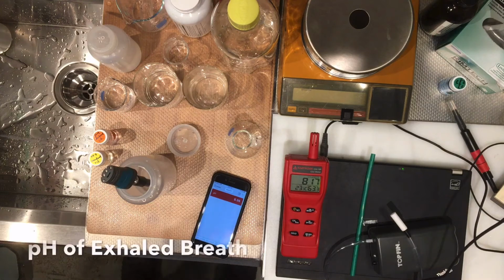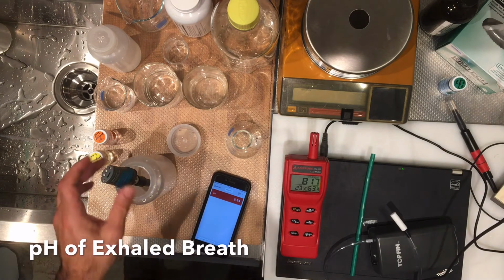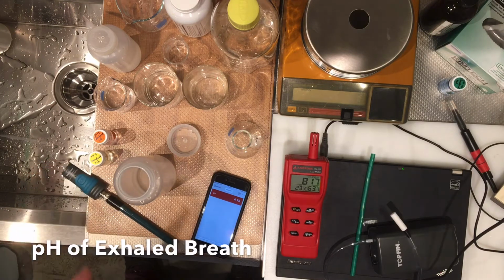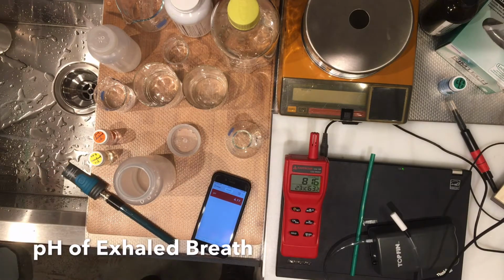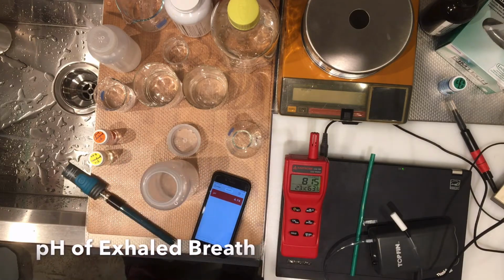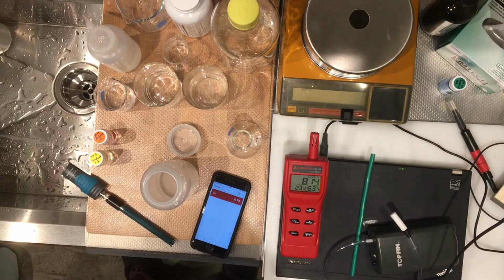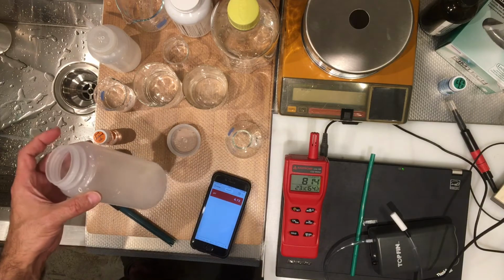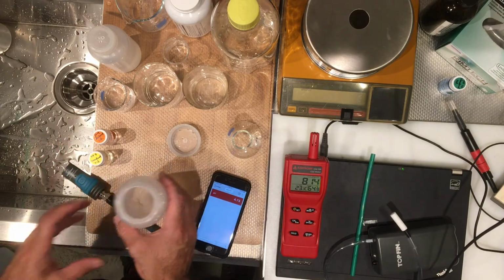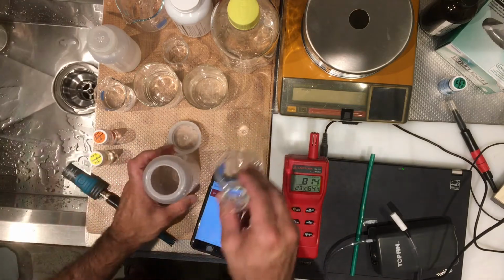In this video, I'm going to show you what happens when you exhale and hold your breath and exhale into this plastic container, and we measure the pH of the water in contact with the air, and then we can find the parts per million carbon dioxide that's in my exhale. So let's go ahead and do that. So the process goes like this.